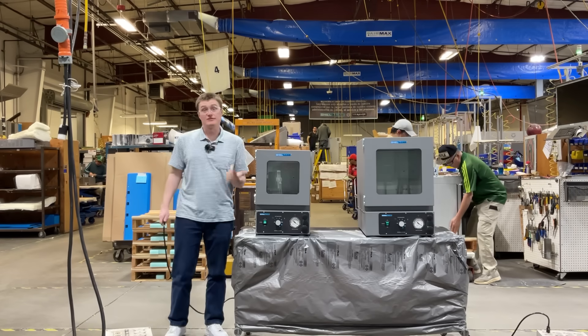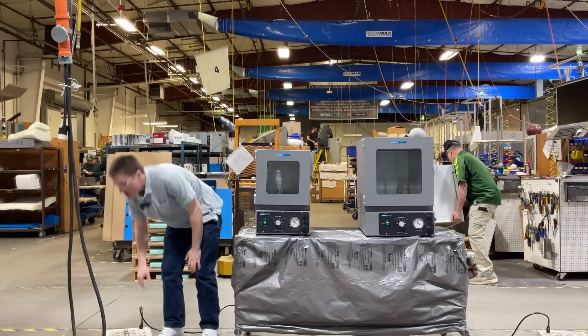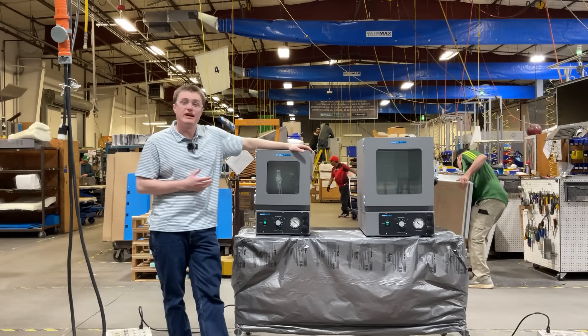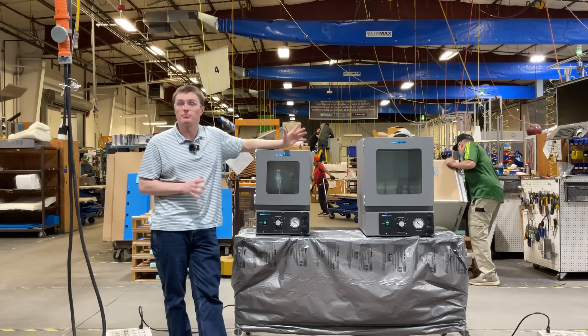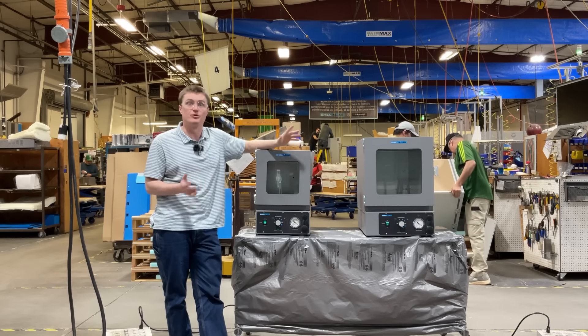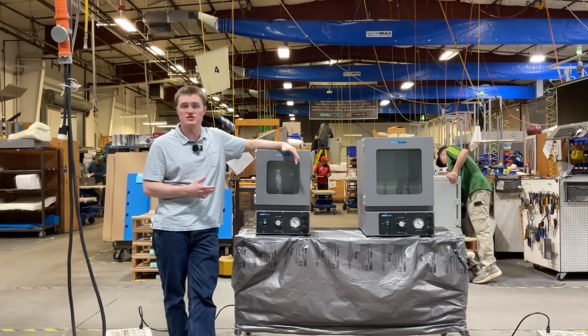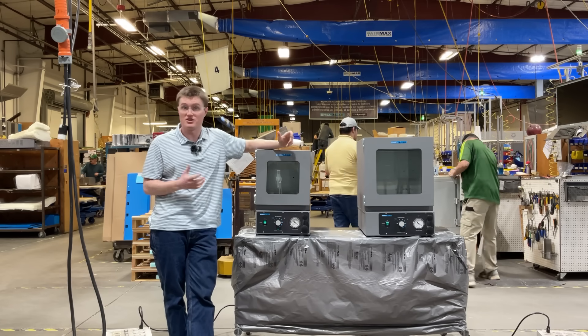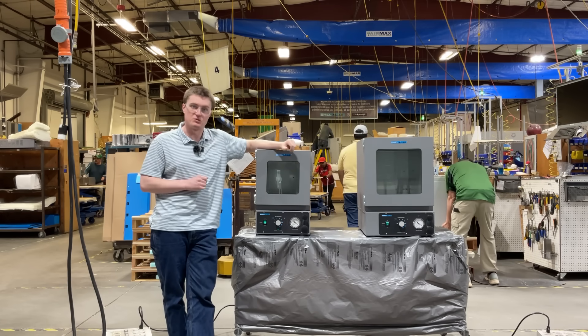Let's get the units connected to electrical power. It is important to note, before I turn these on, that each unit must be connected to a properly grounded electrical outlet before you power it on. For details related to electrical installation, as well as other installation requirements such as clearances, please reference your user manual for details.